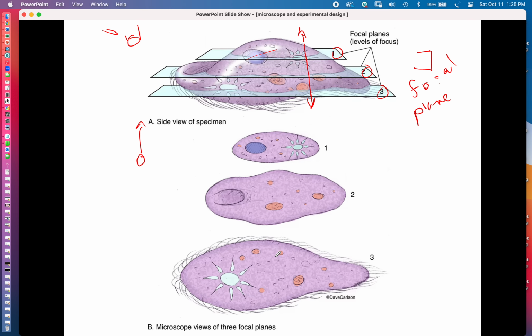They're just blurry. We can see the crisp focus on this, and it looks good. But these other layers are called out of focus information, and they decrease the quality of the image because they're just making the image blurry. They're not helping at all.